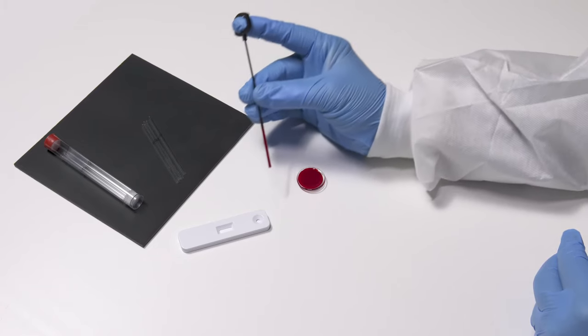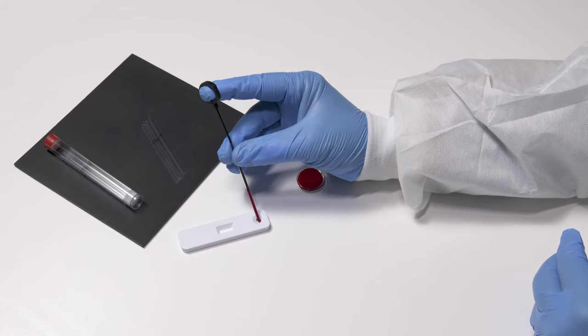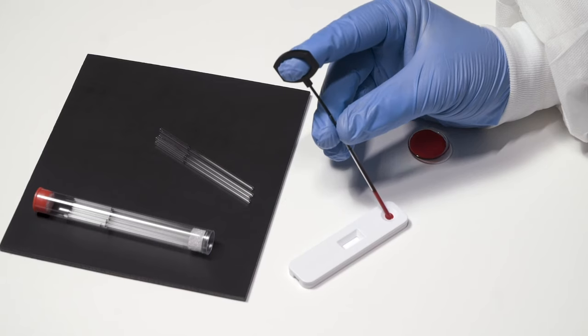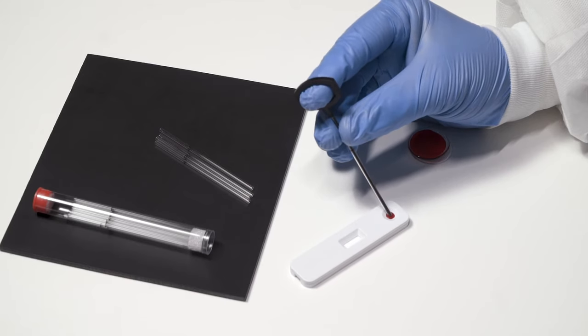To dispense, simply hold the tube over the desired sample target area and apply slow, even pressure until the desired amount is dispensed.